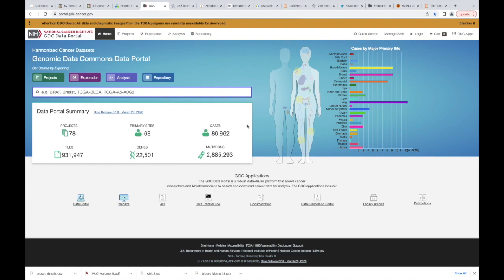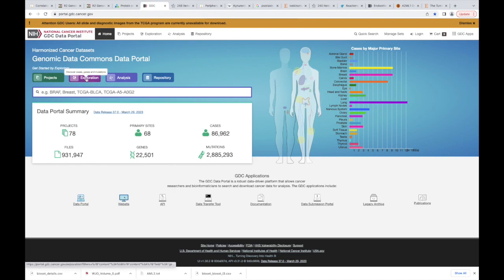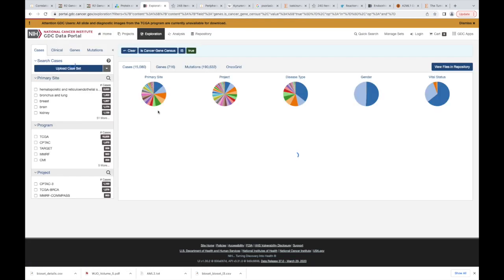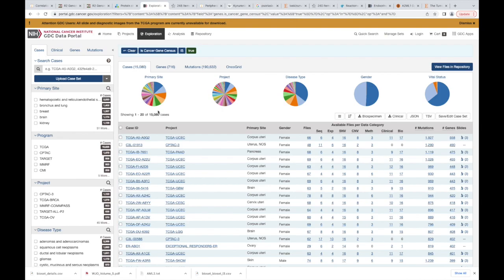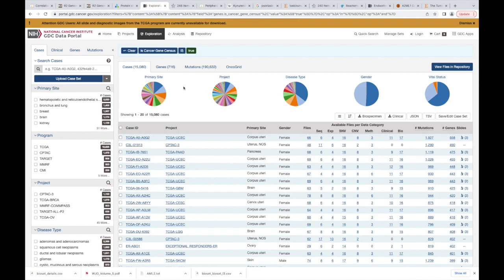Let's go in here and let's look at exploration. Click on that purple dot thing. What this allows you to do is I could get so granular - I could find certain cases where, say, I want breast cancer, I want say triple negative, and I want a particular mutation in these individuals. I can go into this database and find those exact samples. Pulling it out is a whole different matter. It is horrible.